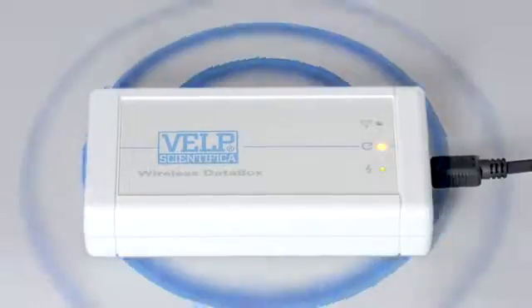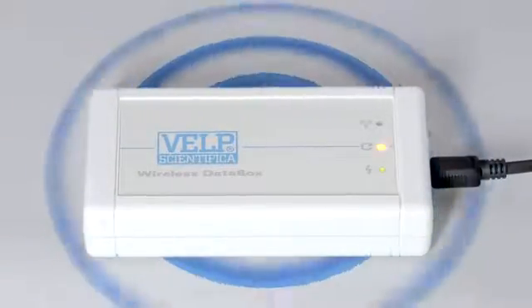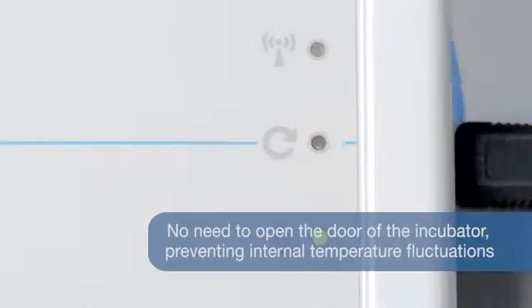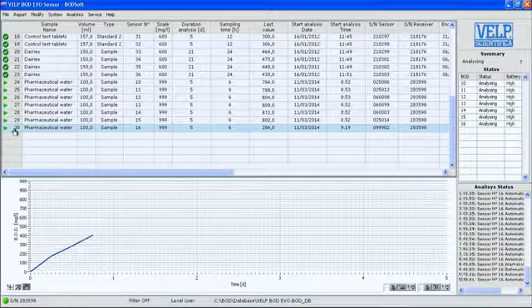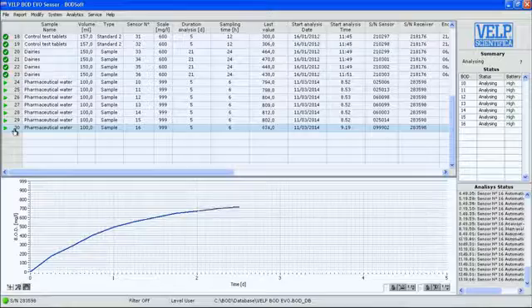BOD-EVO sensor ensures outstanding reliability as there is no need to open the door of the incubator for data monitoring. There is no risk of internal temperature variation during the test.